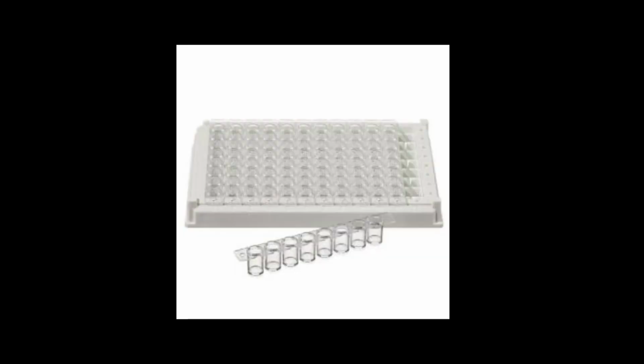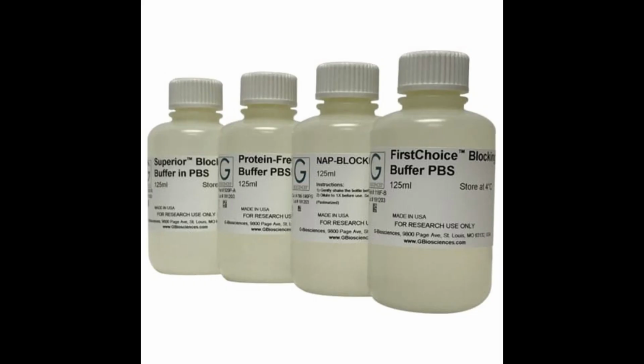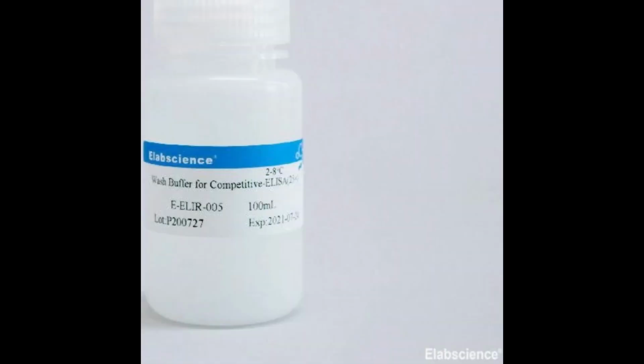The materials we use to conduct the ELISA experiment are microstrip wells coating antigen or antibodies, a blocking agent, a primary antibody, a secondary antibody, an enzyme substrate, and a washing buffer.